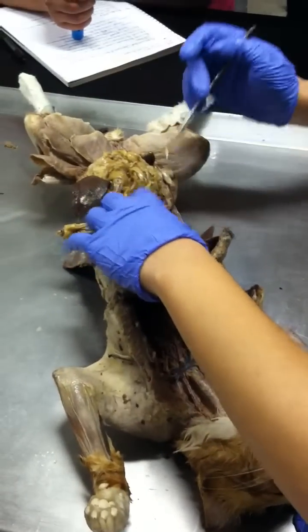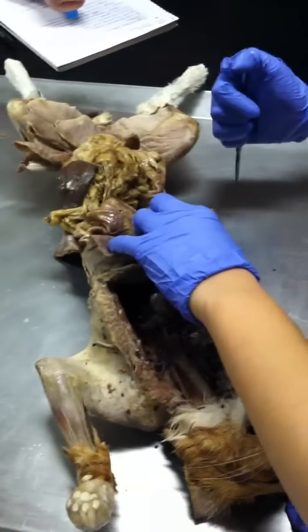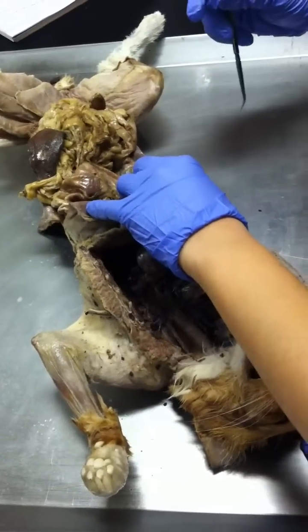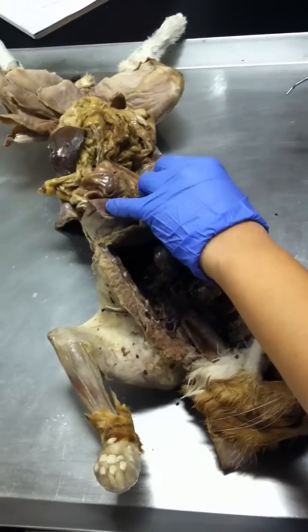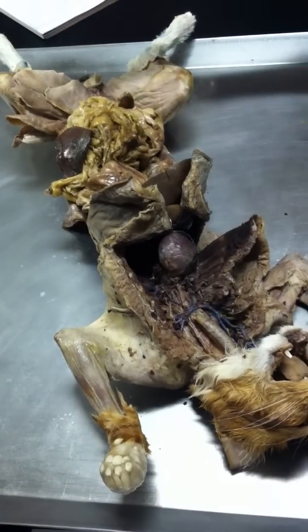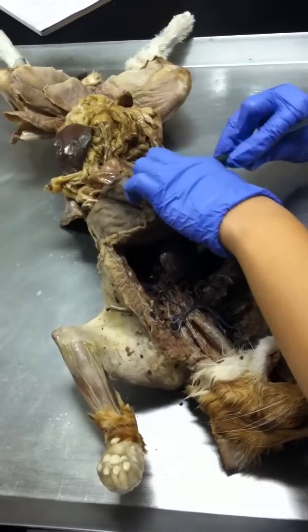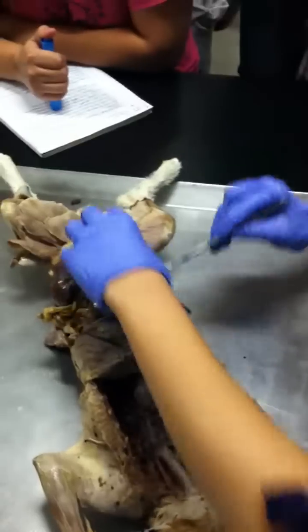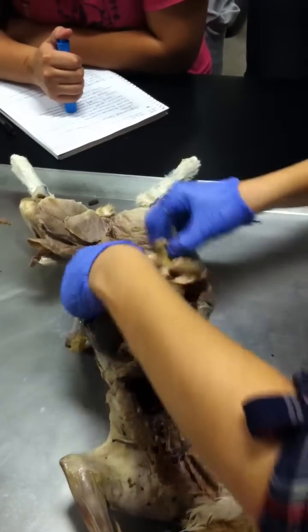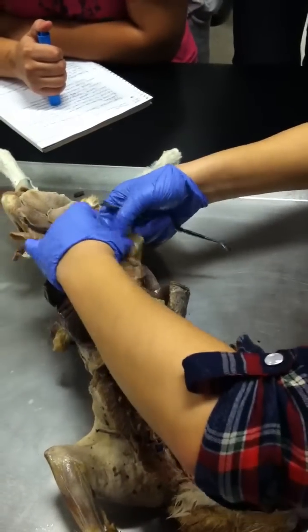Right after the stomach, we have what organ first? The duodenum, right? Which small intestine? The duodenum. So remember I said if I ever pin the small intestines, I would pin it closer to the ends or smack in the middle, right? If I pin this end, this is probably the what? Duodenum. If it's smack in the middle, jejunum, right? And then towards the very end, ileum. If you could, I could find it.